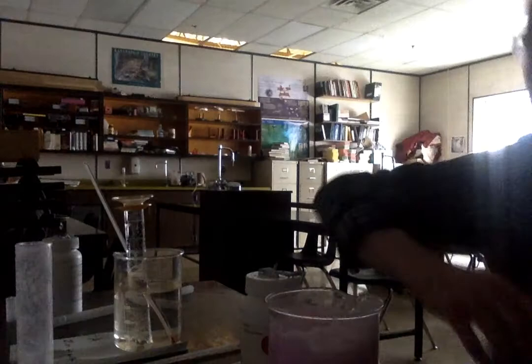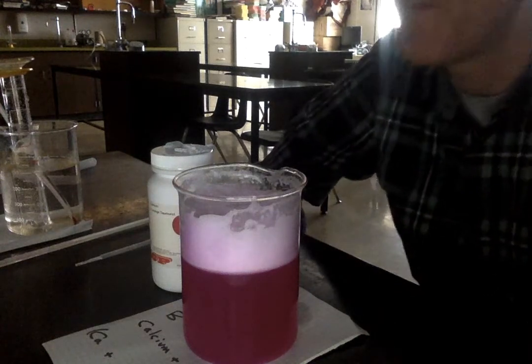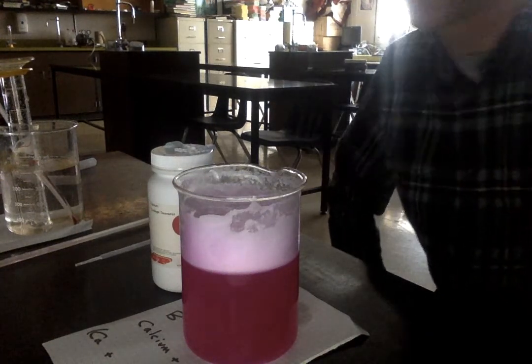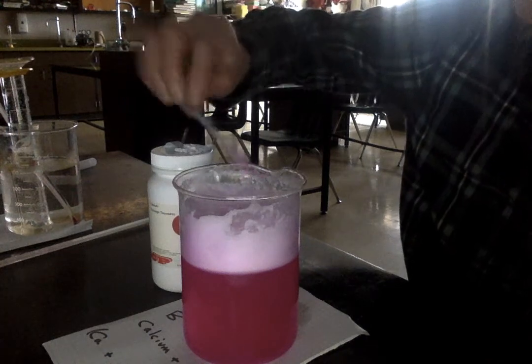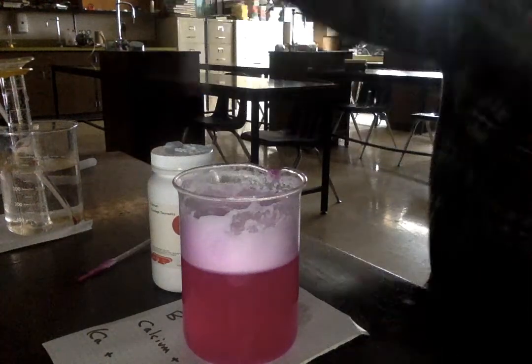What did happen there, you could just see, was that some of those bubbles started to burn. We got little popping noises. That's possible to show a little bit better. I think what happened is that the foam just got to be far too fine of a foam.